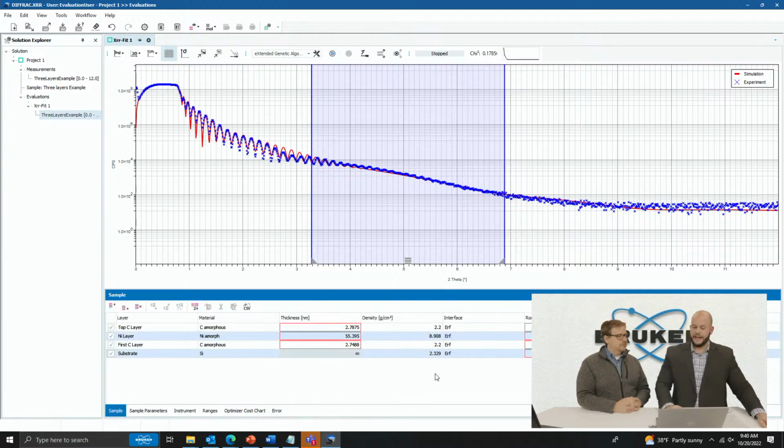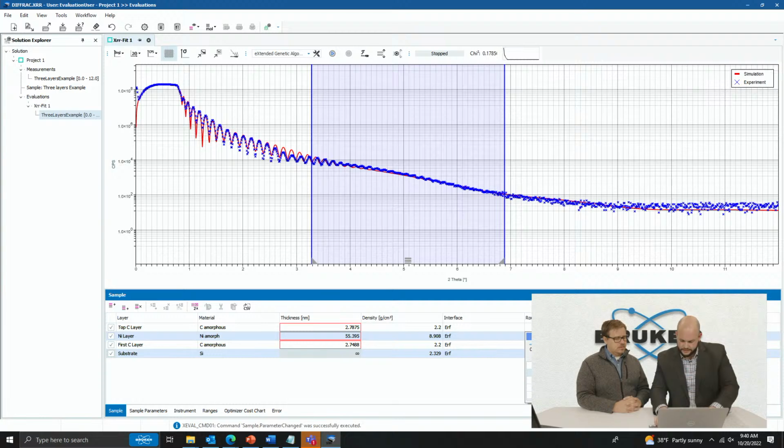And again, if you're not happy with the calculations that it just ran, you can always undo it. Yeah. So that's always nice. So let's go ahead, and you can see that there's definitely some roughness to this sample. So I'm going to kind of let this float a little bit more. Let's go like 0 to 2 on each of these.